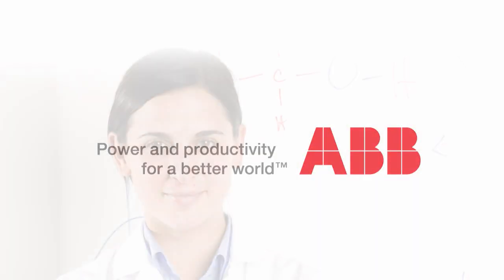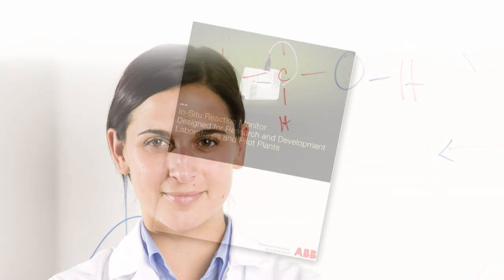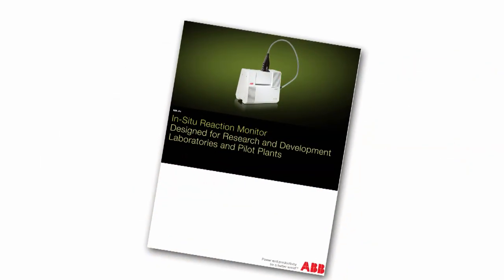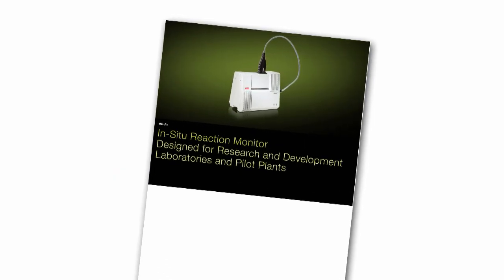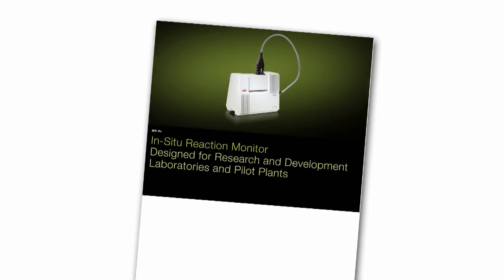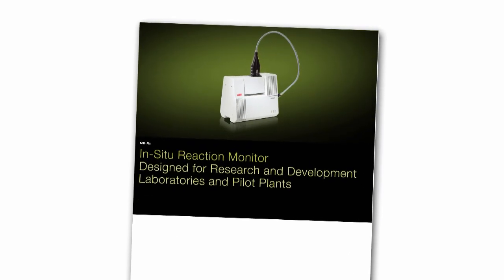ABB introduces the MBRX Reaction Monitor, a dedicated FTIR analyzer for in-situ monitoring of chemical reactions.